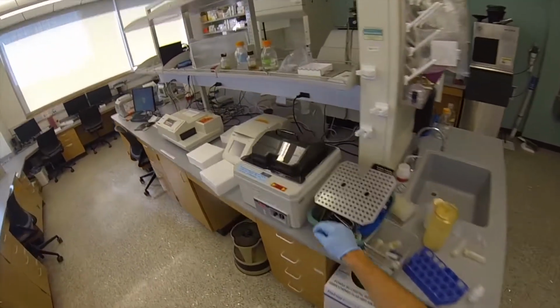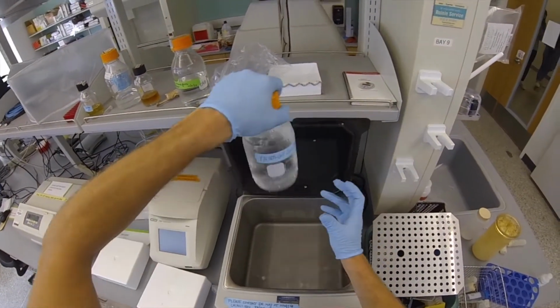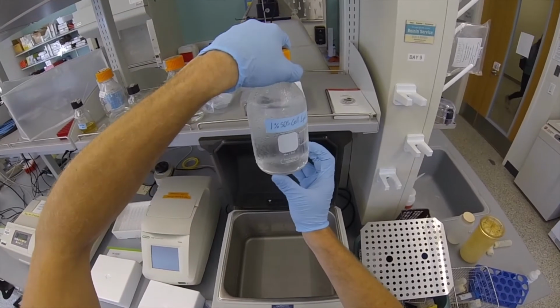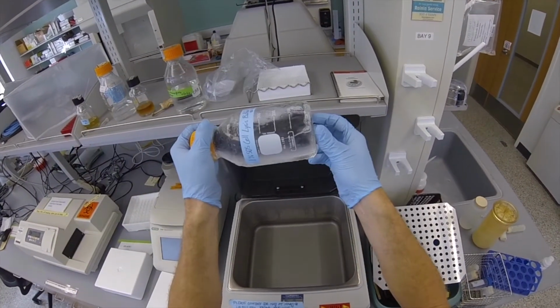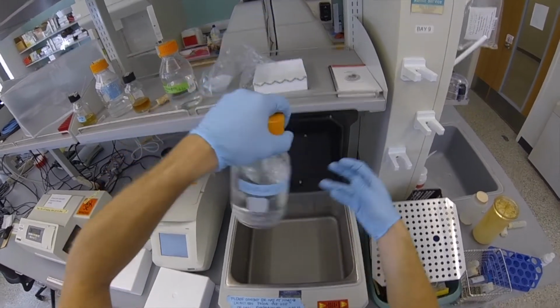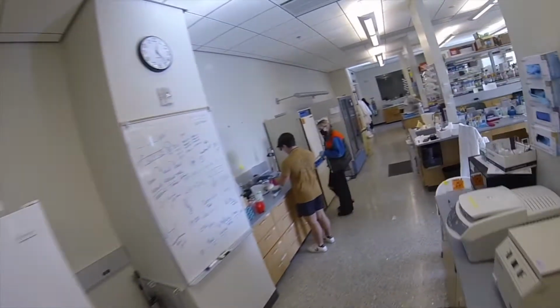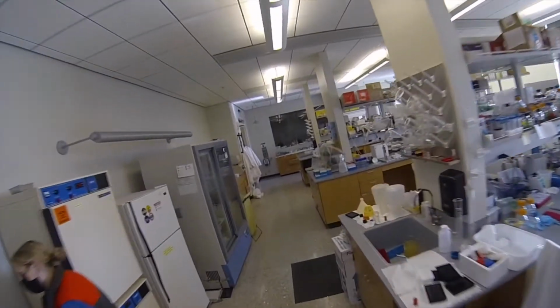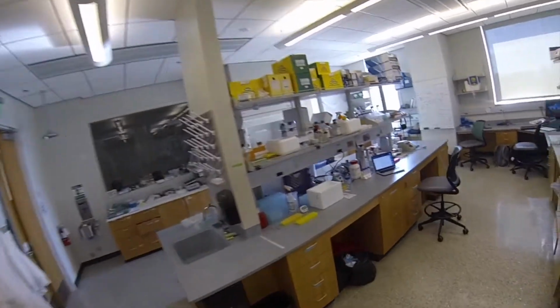Next, you're going to go over to the water bath and check if the 1% SDS cell lysis buffer is clear. If it's clear, then you can bring it back to the lab bench. If not, it may need a few more minutes. Once the cell lysis buffer is clear, make sure the water bath is at 65 degrees Celsius and bring it back to the lab bench.